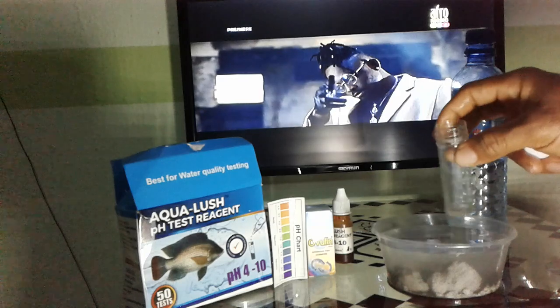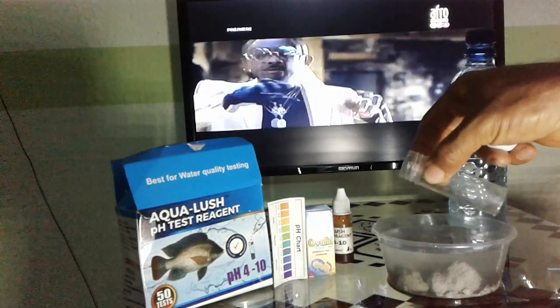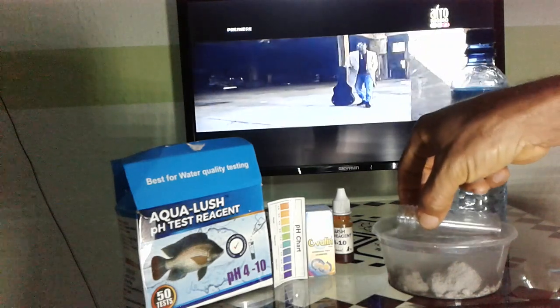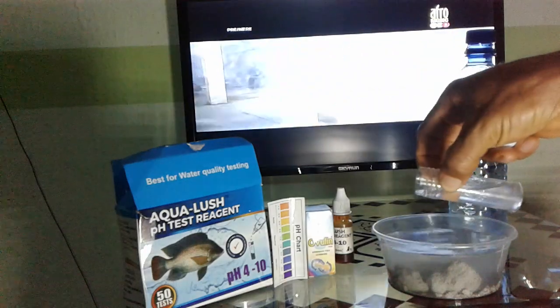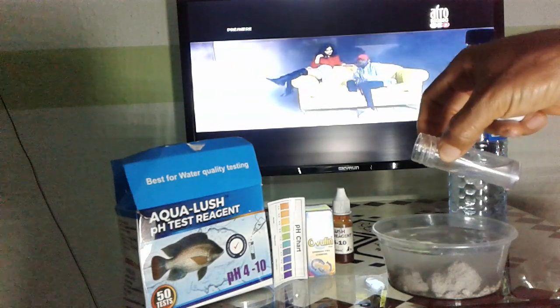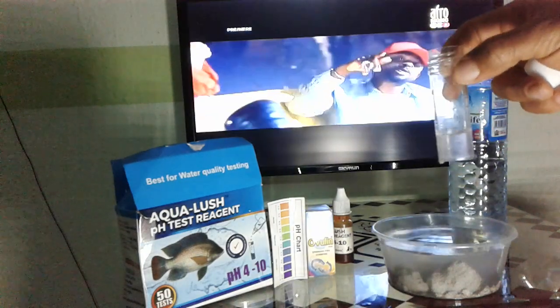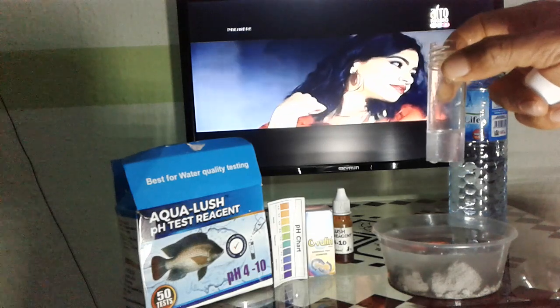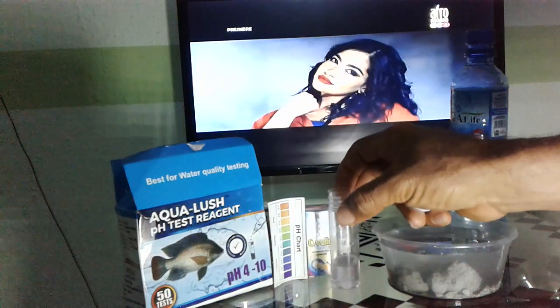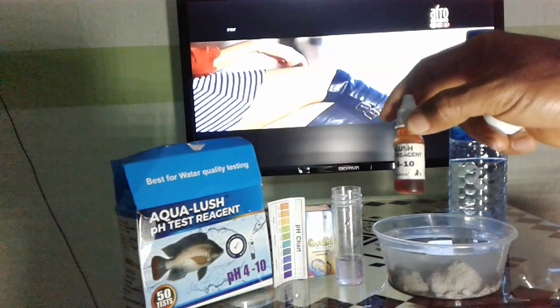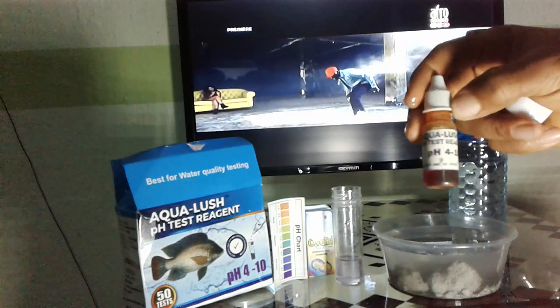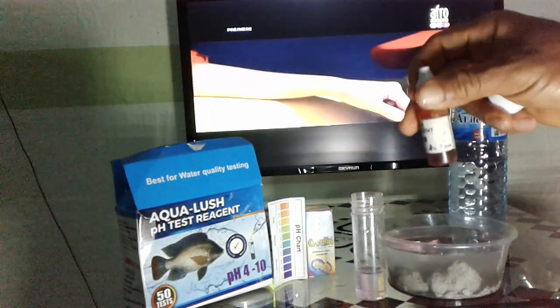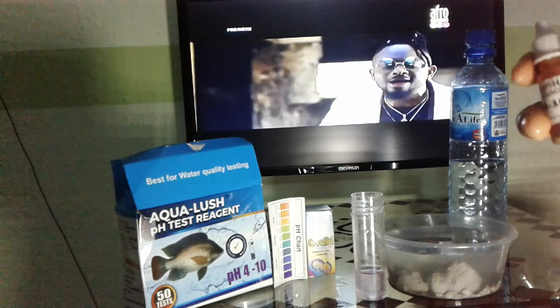The cement caked due to moisture, so let me take a sample of the water. Let's take this to represent our concrete pond because of the cement dissolved in it. I'm going to take a little quantity of this water into my test tube. Now let's test this water to know if it is acidic or alkaline in nature. I'm going to drop in a little of this pH tester, then take it down to the chart.